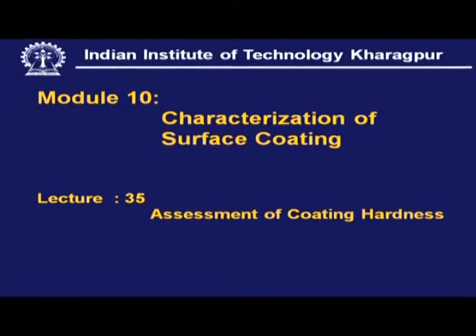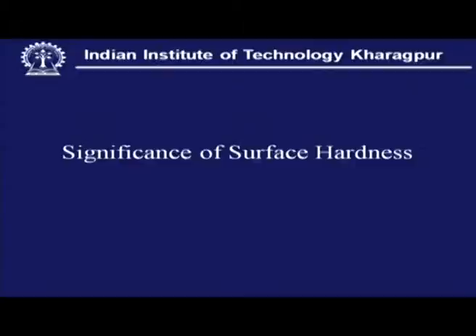Assessment of coating hardness. Now, in all coating activity, particularly for those coatings which are going to be mechanically functional, this hardness measurement is of prime importance.